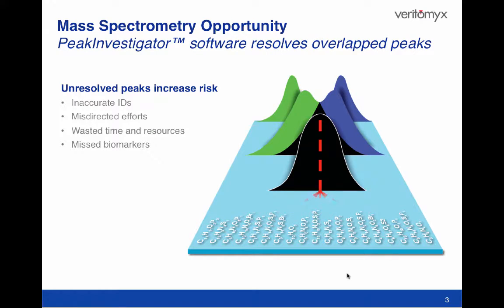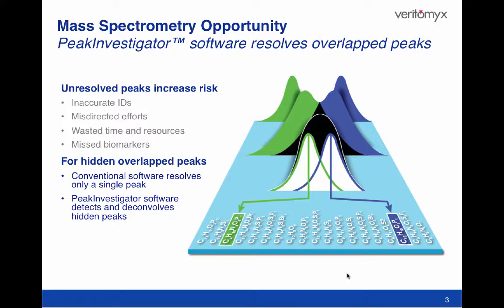PeakInvestigator uses advanced signal processing methods with potent statistically powered capabilities for peak detection and deconvolution. More accurate peak lists lead to improved compositional identification and allow you to identify previously hidden peaks.